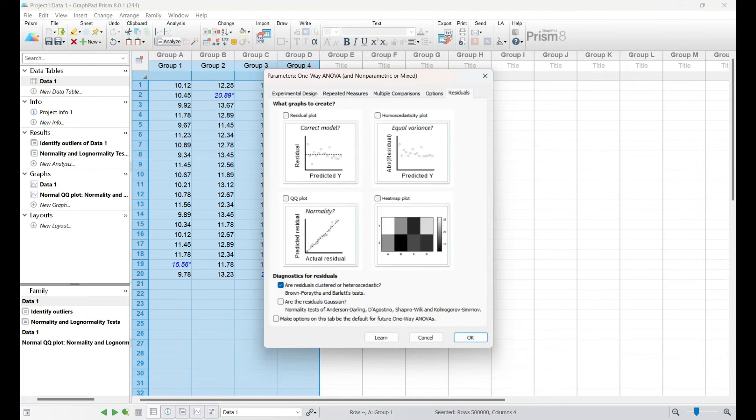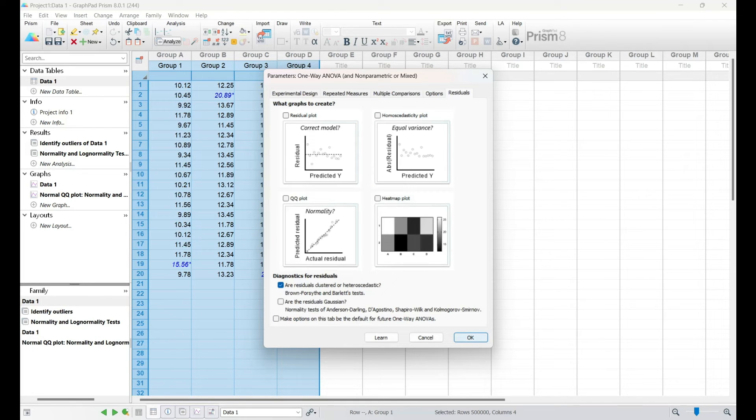Whether it's a T-test or ANOVA, you'll gain a solid understanding of the steps involved, empowering you to apply these principles as we navigate through the results.